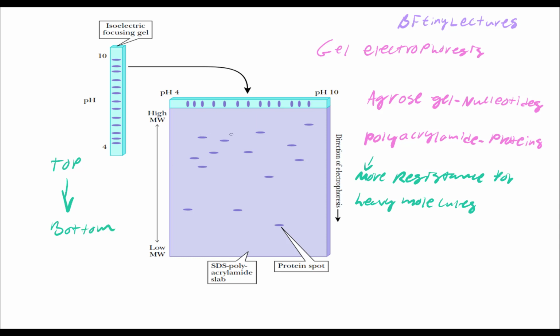And it's saying that right here, when I look at this, I'm saying, well, over here, we know that this is going to be a heavier molecule. So this is heavy. And this one is going to be lighter. So this is light, meaning that it's not as big or bulky, okay? So let's say that this one has a Dalton of, let's say, 100,000.